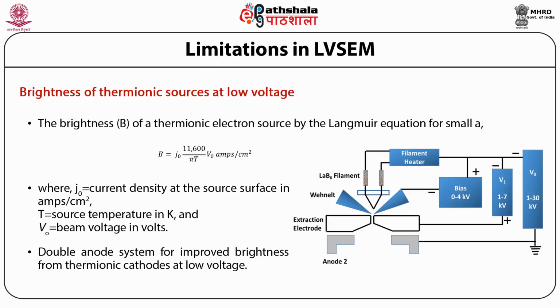The LaB6 cathodes have a comparably more pointed tip that reduces the space charge effect and are about 6 to 10 times brighter than the tungsten source for comparable lifetime. They also operate at lower temperatures than normal tungsten, T equal to 1500 K to 2500 K.